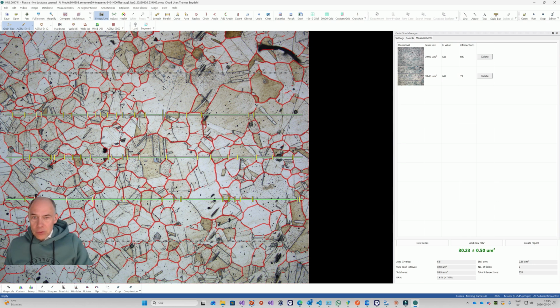If we want, we can count intersection among 3 as 1.5. Then I double click on that position and it appears in another color. Yeah, here's one detected by itself. Yeah, we're happy with this.